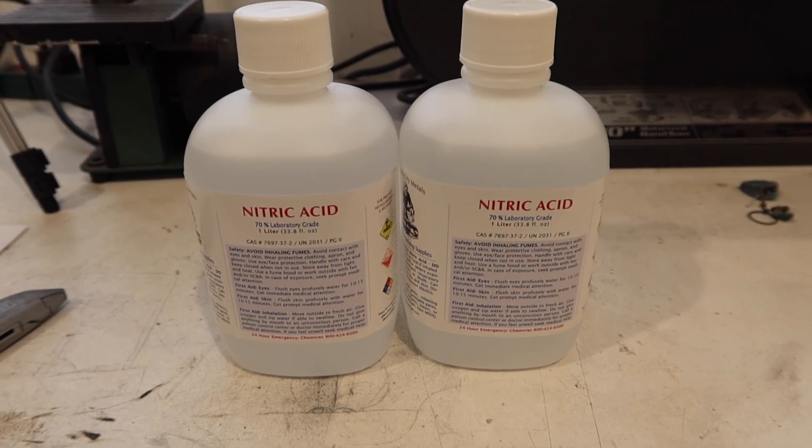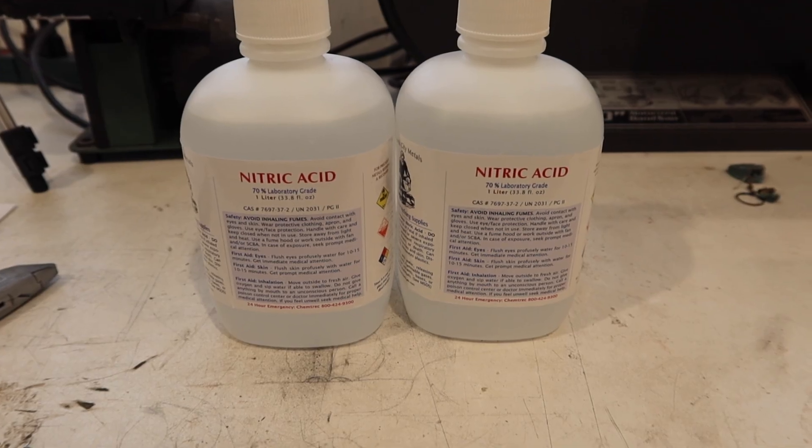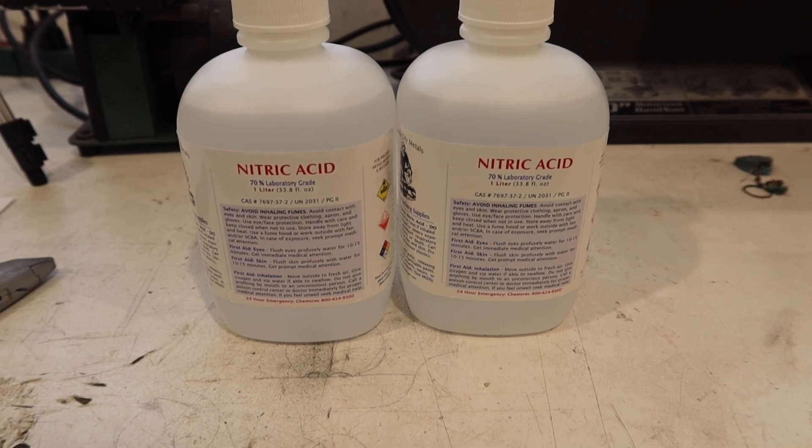The nitric acid I bought from a seller on eBay. I'm hoping I'll only need one liter, but I've got two just in case.